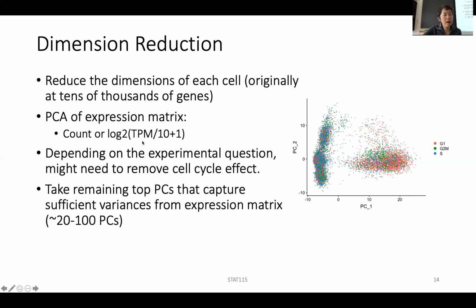And if you run PCA on some single cells, it depends on the experiment. Suppose you are using a cancer cell line that's growing very, very fast, and let's say it's a pilot experiment, we're not even treating the cells with drugs yet. You just look at this fast-growing cancer cell and do a single cell experiment. You might see that the first principal component, which really separates the noise in the data, is the cell cycle, because the cell is growing fast, right?